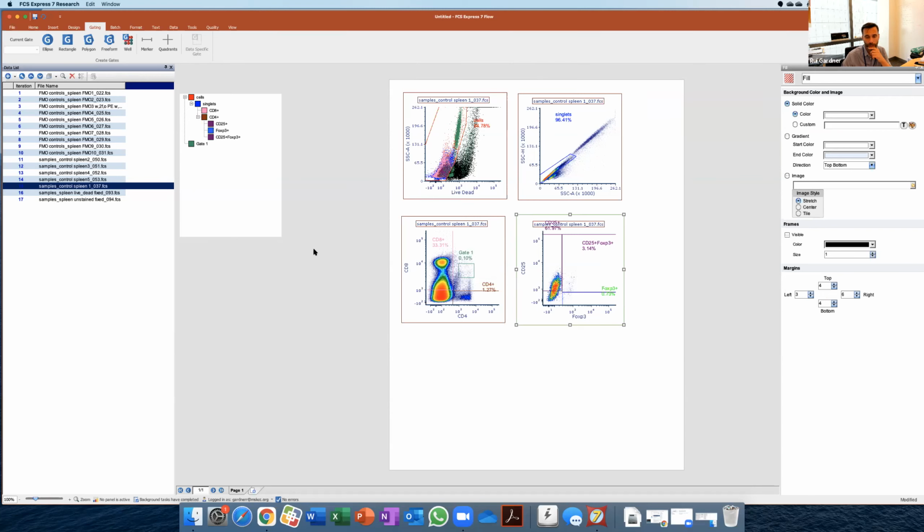So we still have some time. I can show you a little bit of statistics. Well, I've got a question here in the chat actually, which is quite a useful one. What type of plot would you recommend for publication? Right, I can have a go at that. Yeah, go ahead.